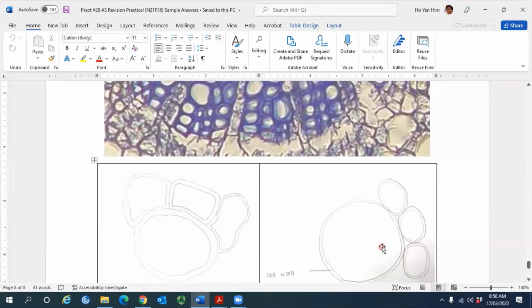Okay, so you check your own drawing. See the thickness of the wall. Is it representing that actual thing that you're seeing or not? Because you can see now very clearly that this is actually not correct, even though I asked the student, are you sure the wall thickness is correct? Yeah, teacher, is correct.